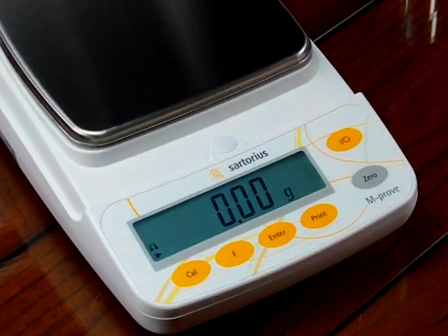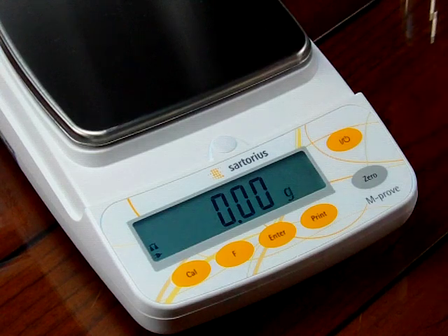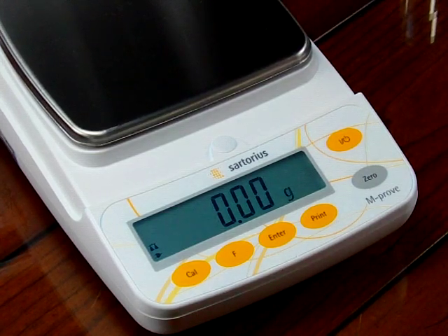A lot of people will call us and say they don't want grams as the primary weigh mode. In order to get into this function, it's a little bit tricky and we'll walk you through how to do it. It is in the manual, but it really doesn't explain it that well. To get into this function, we have to get into the codes.